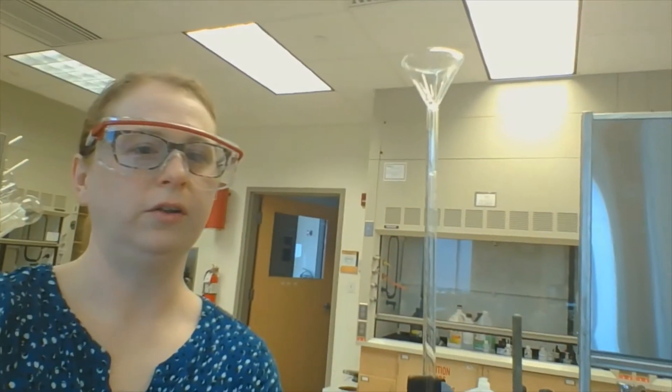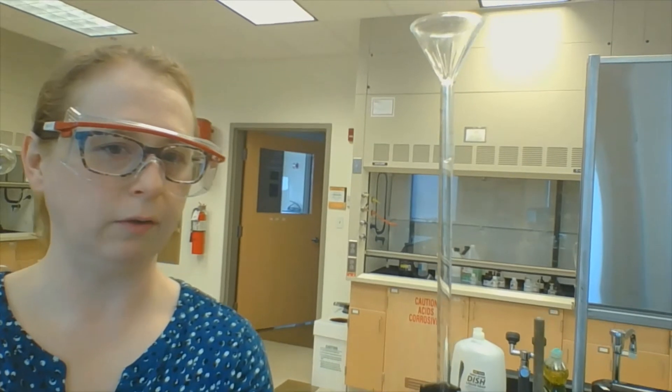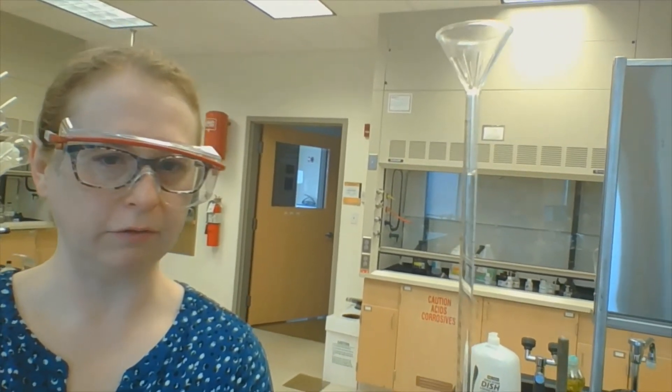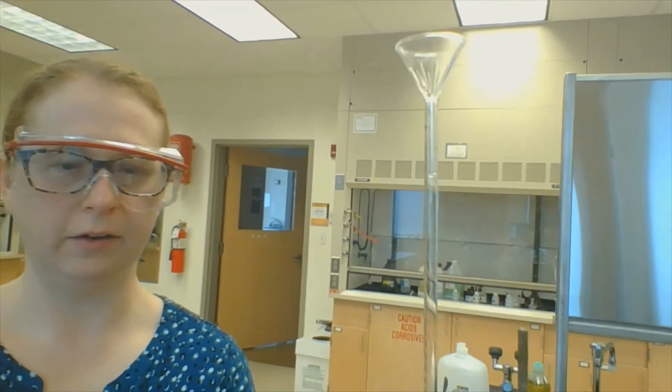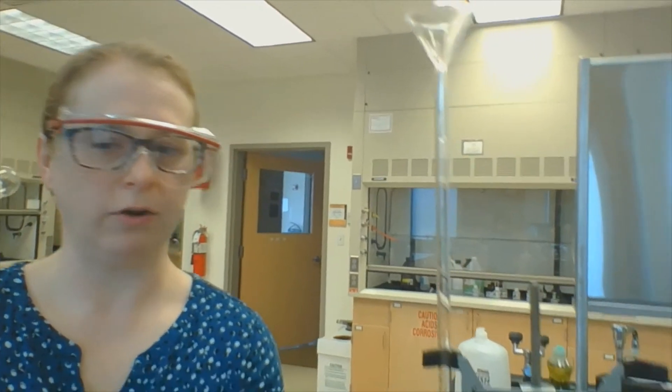I can take this funnel and pour. My goal is just to fill it — I don't really care exactly how much, I just want to not fill it over the top. I'm going to pour some in right now, and what I'm filling it with is sodium hydroxide.